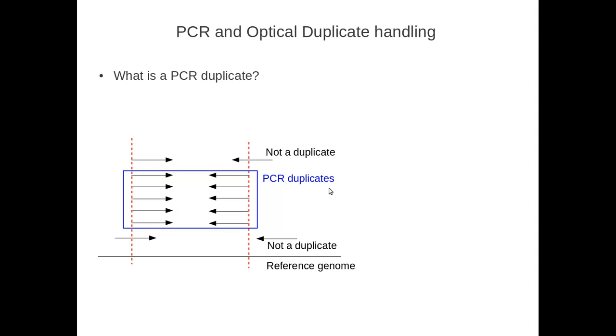A read, this means the fact that these reads map to the exact same positions means that they come from a fragment that was randomly sheared at the exact same positions. Now, it is possible that these are not PCR duplicates and that they come from two independently sheared fragments from the original genomic DNA preparation when we went into preparing the libraries, that we happen to sequence totally independently. That is possible, but it's highly, highly unlikely, unless we're sequencing at extremely deep coverage.